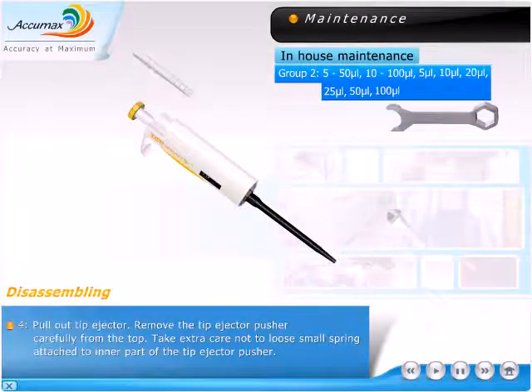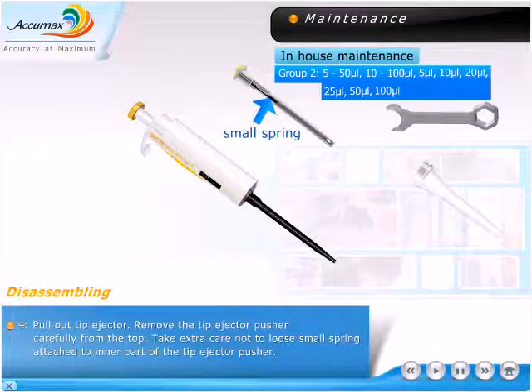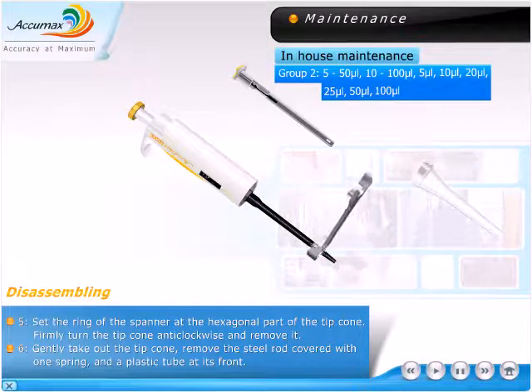Remove the tip ejector pusher carefully from the top. Take extra care not to lose the small spring attached to the inner part of the tip ejector pusher. Set the ring of the spanner at the hexagonal part of the tip cone.